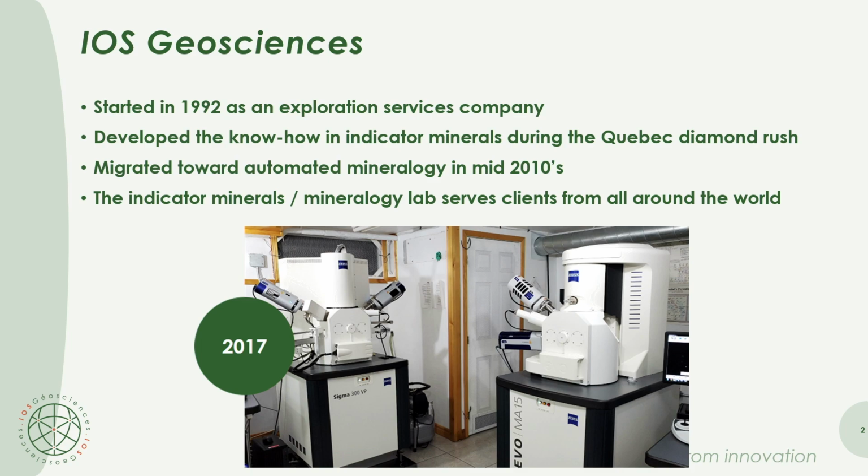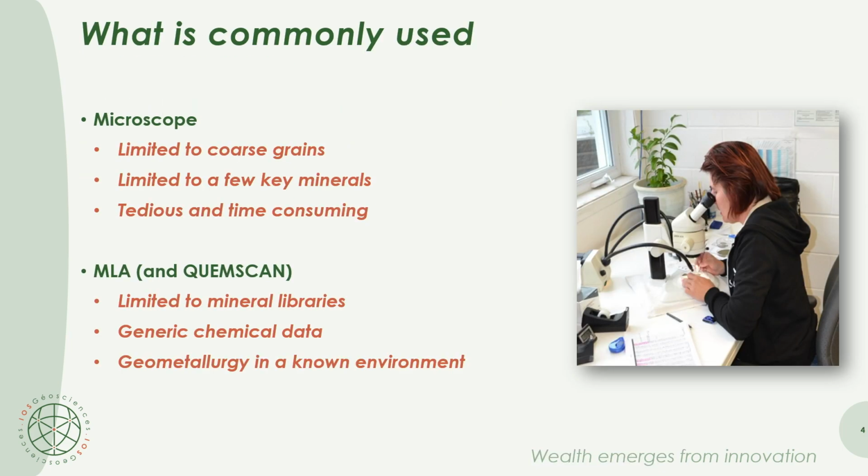We own 2 SEMs. As far as I know, we're the only commercial lab with 2 detectors on one, and we added the EBSD, which I'll talk about a bit later, to one of the SEMs as well. So I'll skip that one.